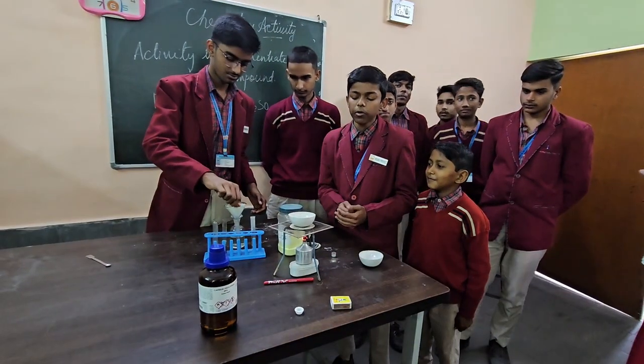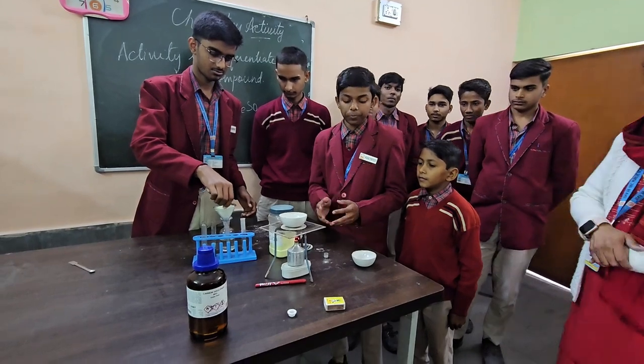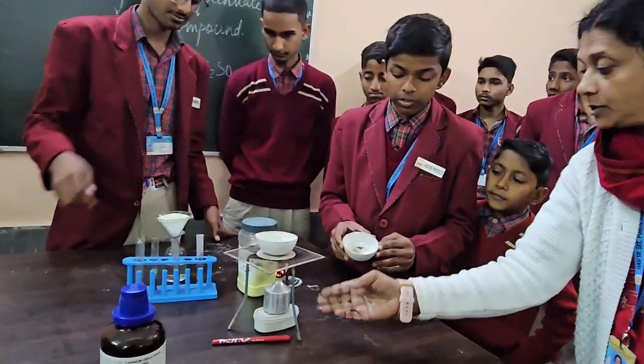Iron filings and 3 grams of sulphur powder are combined, and on heating they form a compound FeS. You can see that the compound FeS is formed.